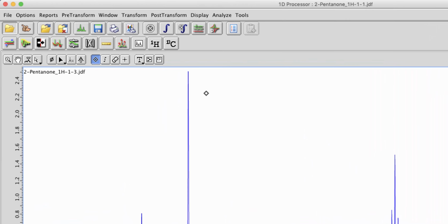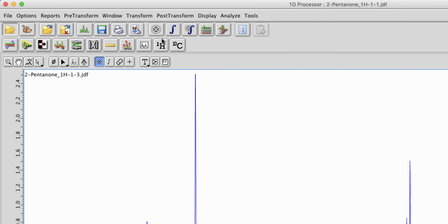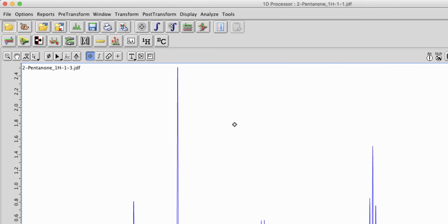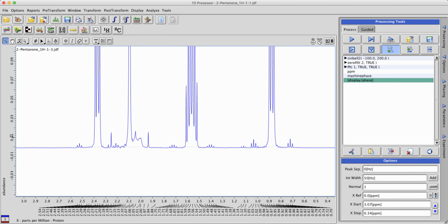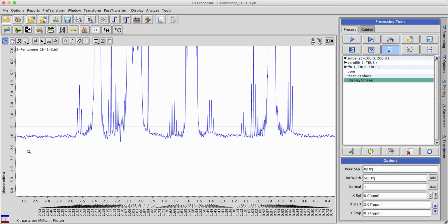You can also do a mass peak pick on the spectrum by clicking this button here. But notice in this case, a lot more peaks are chosen than what it seems like are present. If we zoom in along the baseline, we'll see carbon-13 satellites and some other peaks.